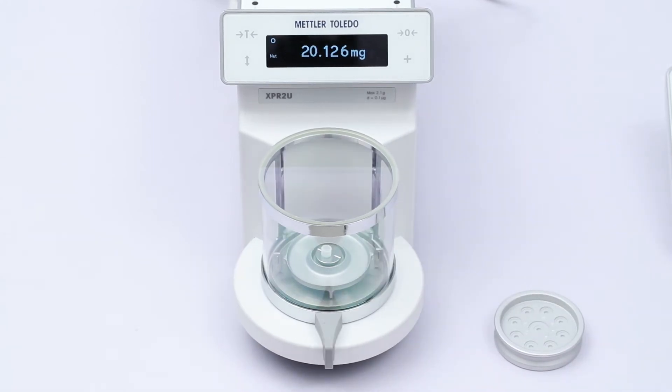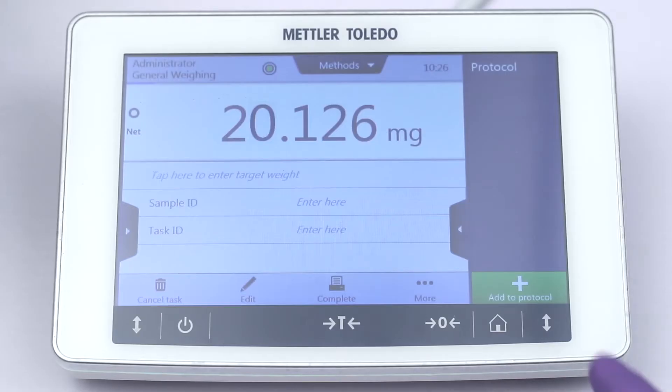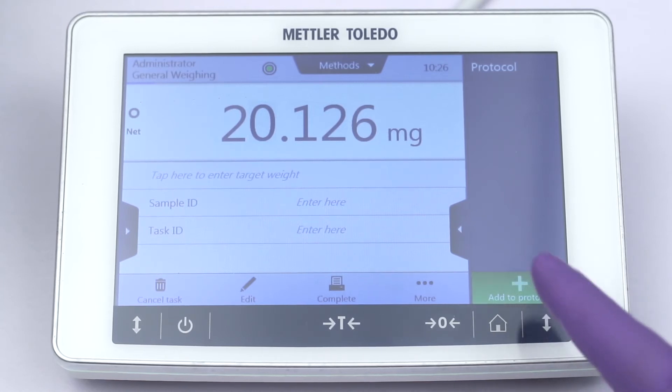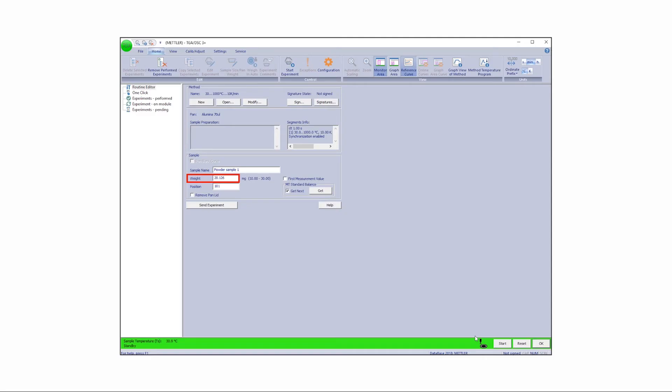Press the Add to protocol key on the balance to transfer the weight value to STAR-E software. The sample weight is now visible in STAR-E's Routine Editor.